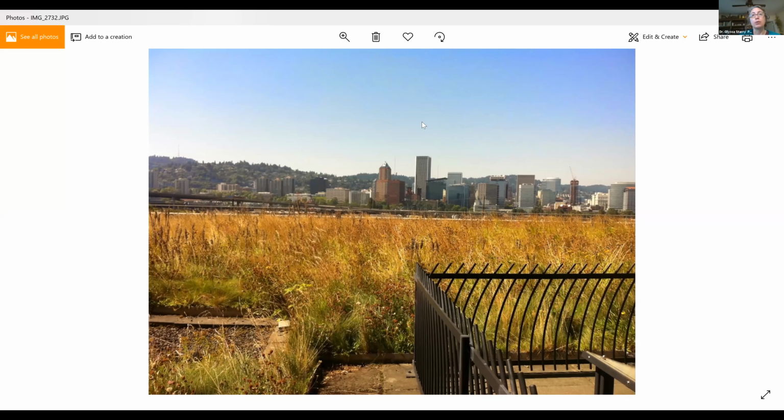But what a lot of people don't know is that Sedum are facultative CAM species. That means they can switch in and out of this water-conserving mode of photosynthesis. A key hypothesis of my work is that they're actually not in CAM when water is readily available, so even these succulent species can contribute to the green roof water balance and stormwater management. We can collect the data we need to test this hypothesis using the CI-340.